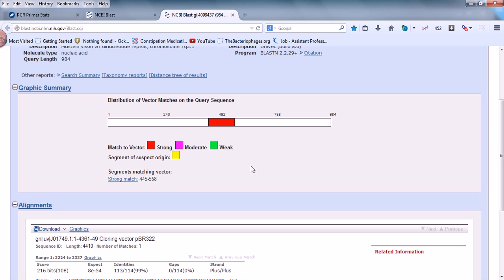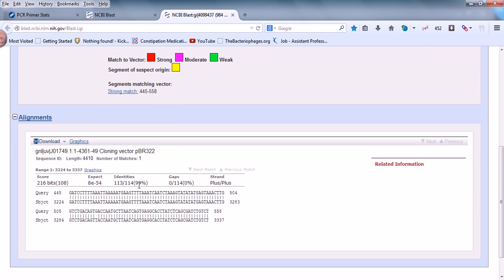The result shows the distribution of vector matches with your query. The white chromosome-like graphic represents your query from position 1 to 984. There is a stretch from approximately position 445 to 558 where a match with a vector was found — shown in red, indicating a very strong match. The vector identified is pBR322, with a percent identity of 99%.